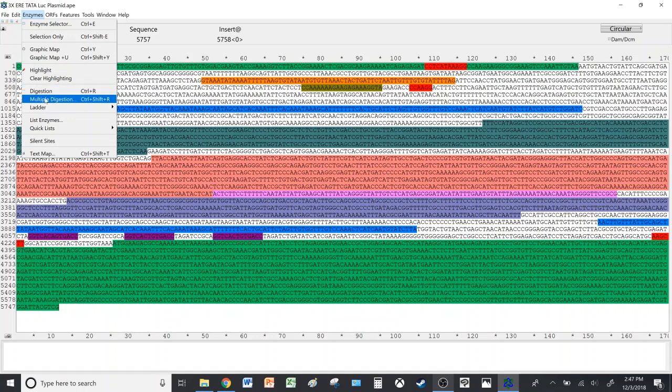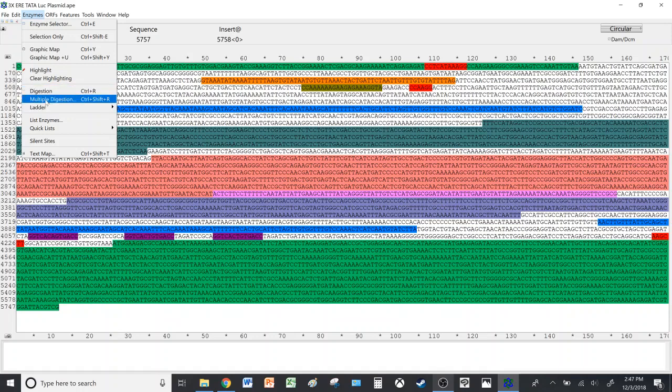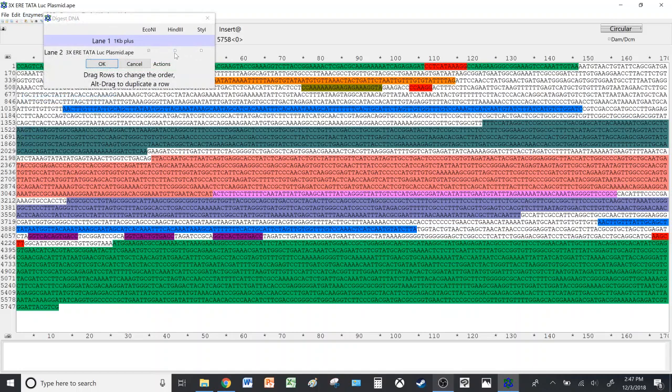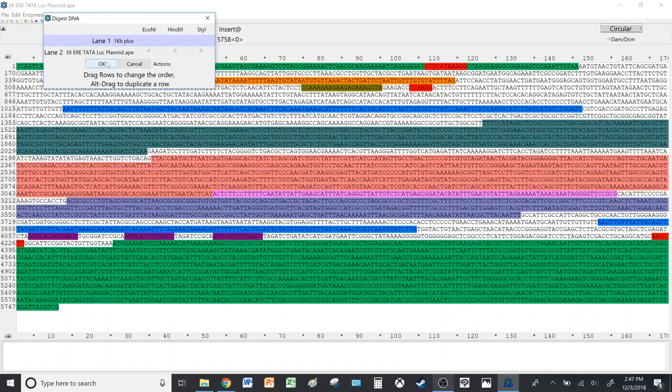We'll take 1 KB Plus, and then we'll take a look at Digestion and Multiple Digestion. I always use Multiple Digestion because it allows you to select and deselect the enzymes you chose depending on your preference or what you would like to see. Then you click OK.